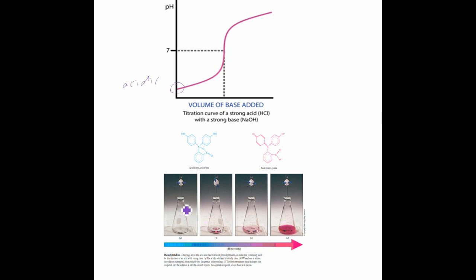So initially, you typically open it up fairly quickly, allow the solution to drain out, and what we see is that it doesn't really change the pH all that quickly, but then all of a sudden, in this steep part of the curve here, going from where it's acidic to where it's neutral might be the difference between 1 drop of the base or maybe even just half a drop of the base.